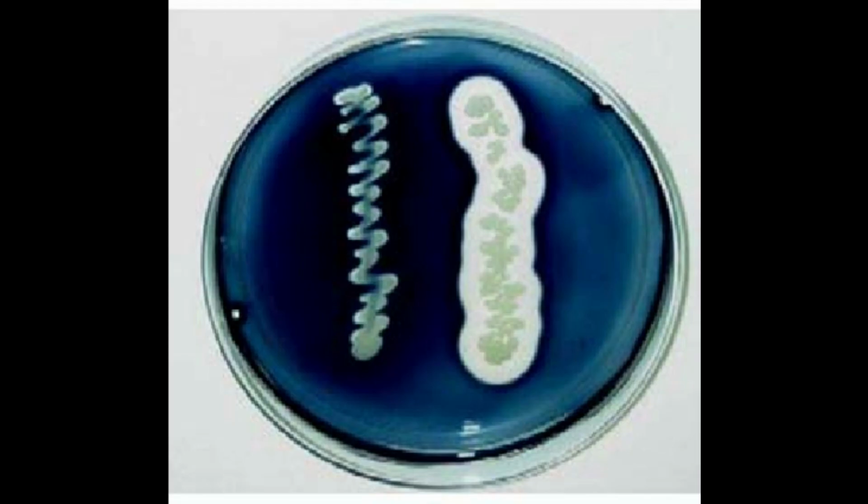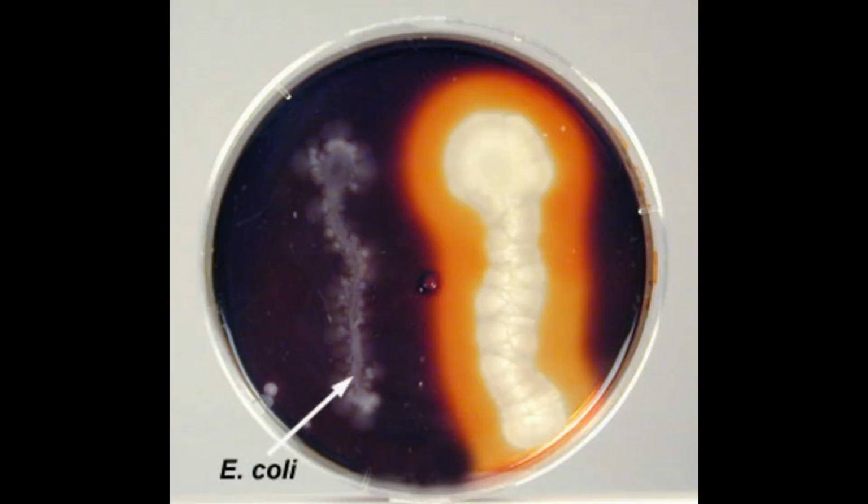Now what will this iodine do? It will react with all the starch available on the plate. So only in the area where there is no starch, no blue-black complex should ideally be found, and on the rest of the plate it should turn all blue-black. This is what we can see in the result.